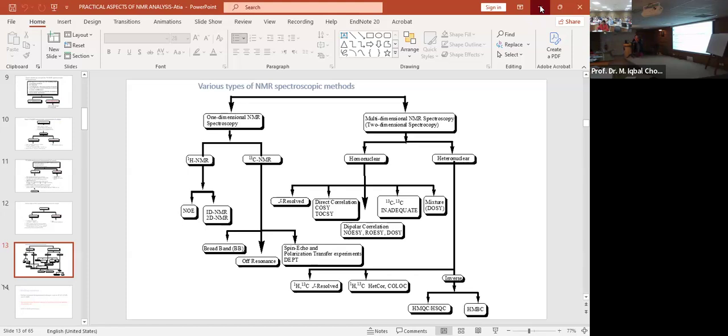Okay, good. Could you please explain question 7? Okay. So another question, could we use more than 0.5 ml solvent, and what is the ratio we could take of our sample and solute? Just think about, suppose this one is an NMR tube.